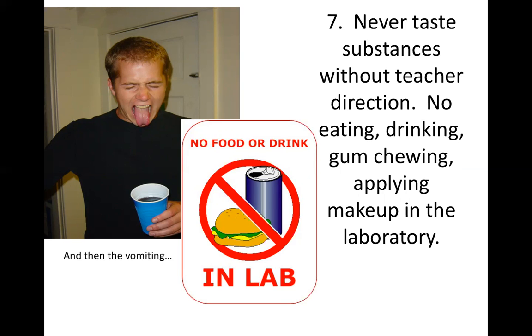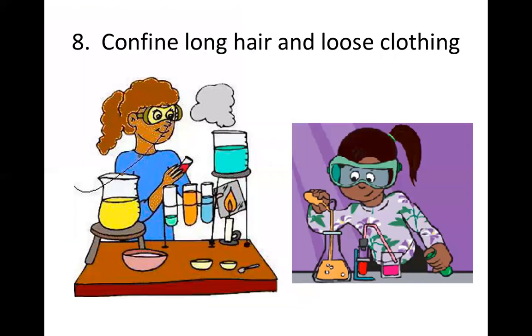The same when it comes to applying makeup. There are chemicals in the lab, and you don't know if these chemicals are in the air or on the table. You don't know how clean the table is, or if the cleaning done was enough to remove all of the chemicals there. And then you're going to apply makeup. So you're basically putting chemicals on your face, on your hands, that can cause chemical reactions or skin irritation. So inside the laboratory, you only do the experiment, but you do not eat, you do not drink, and you do not apply makeup if you're inside the lab.